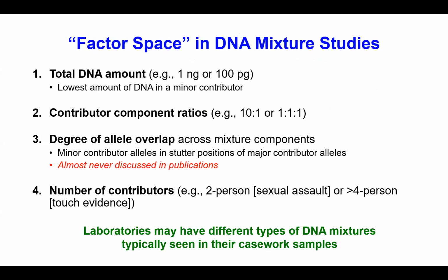When we look at DNA mixtures, there are several aspects that are important to consider. This is what we call factor space, the areas that need to be covered and considered. You have the total amount of DNA being looked at. This might be 1 nanogram or 100 picograms, depending on how much is available in the sample. You also have to consider the lowest amount of DNA that might be present in a minor contributor.